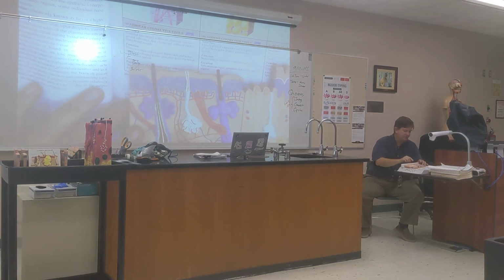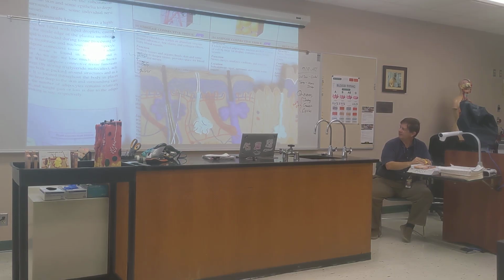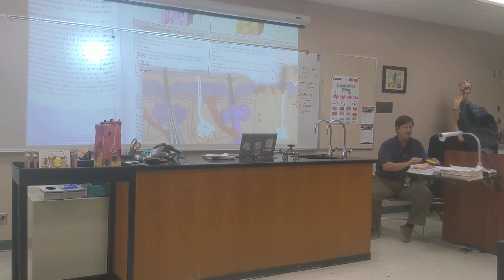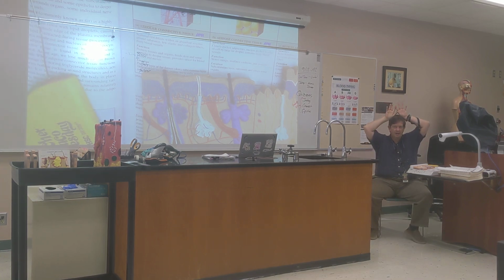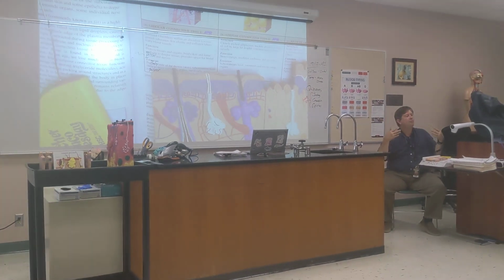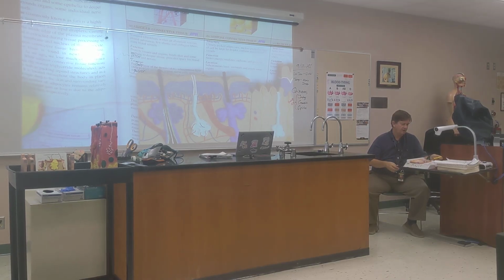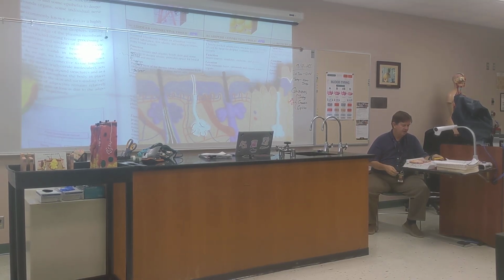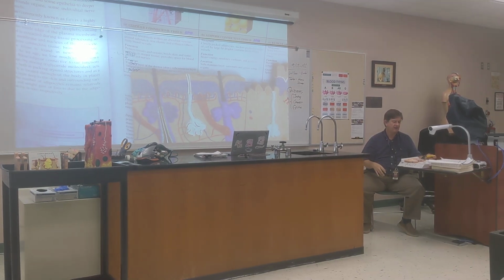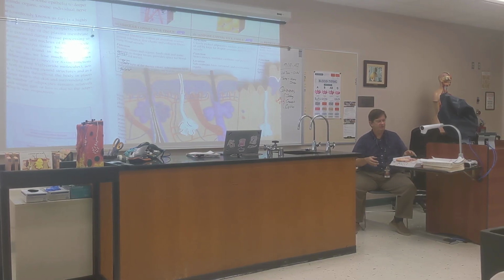But here, do you see, let me get a little pointer. Here we've got a little sticky-up part of the dermis, another, and another. Those things that are sticking up, the anatomists who saw them thought they looked like fingers sticking up, so they called them dermal papillae. The top part of the dermis is the papillary layer. Good, yep. Anything below that is full of reticular fibers, and that's the reticular layer. Are we good? And that's like 80% of the skin.